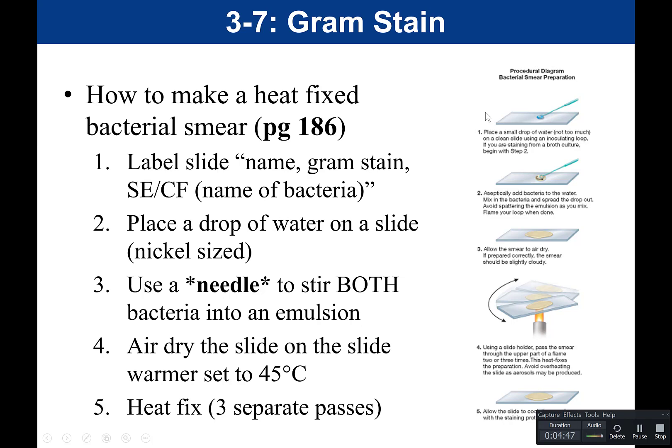We're using Staphylococcus epidermidis and Citrobacter freundii — one gram-positive, one gram-negative. After labeling the slide, place a drop of water so that the puddle is approximately nickel-sized. I use a squirt bottle to add a little water to a loop and then place it on the slide. You want that circle of water to be about the size of a nickel.